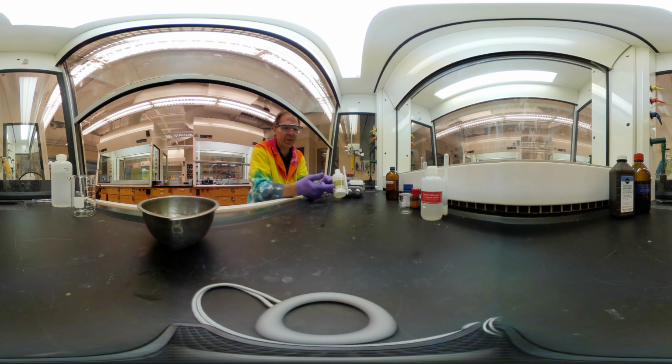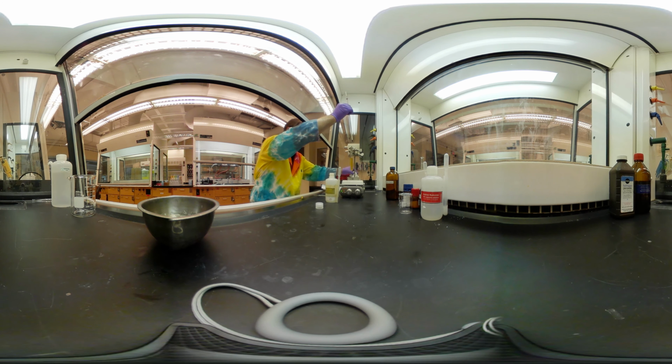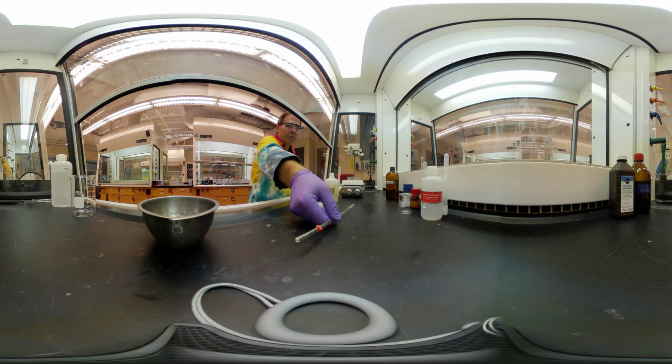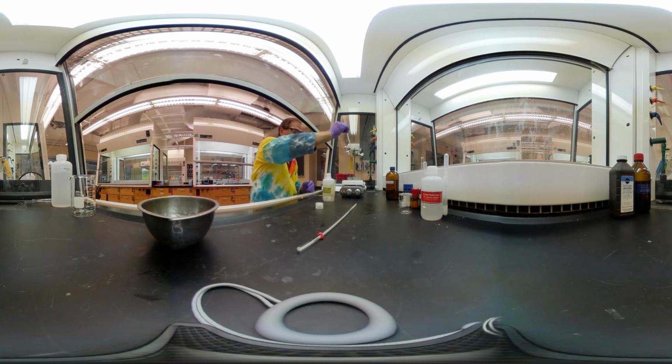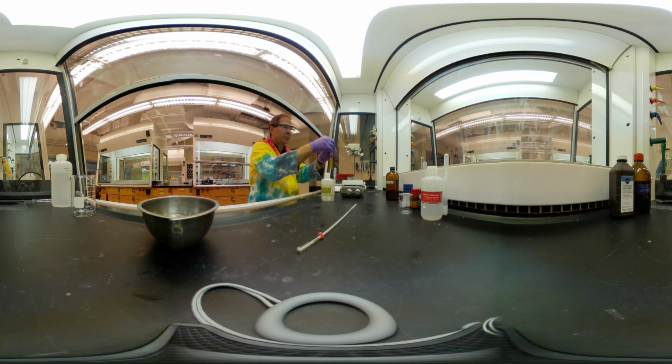I'm going to add 2 milliliters of the glacial acetic acid. Take the thermometer out when I do that. Wipe it off before putting it down. Right. 2 milliliters. Stir this a little bit. We're going to use the finger tap method there. I could use my glass stir rod as well. And then we're going to start to cool this down by running it under tap water.